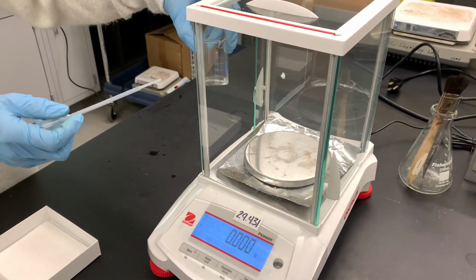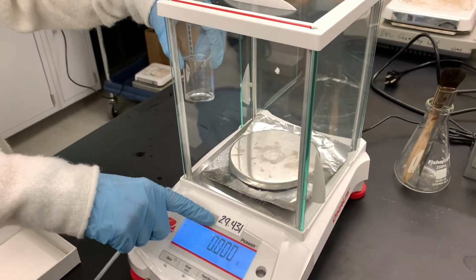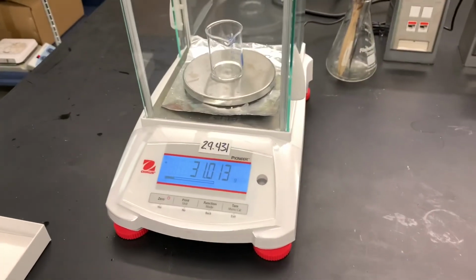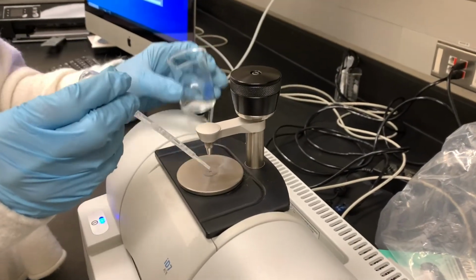Now, what I've done is pre-weighed this beaker. The mass of the beaker is 29.431 grams. And so the difference here is going to be the mass of our product. The beaker with the product is 31.013 grams. We're going to take the IR of this product.